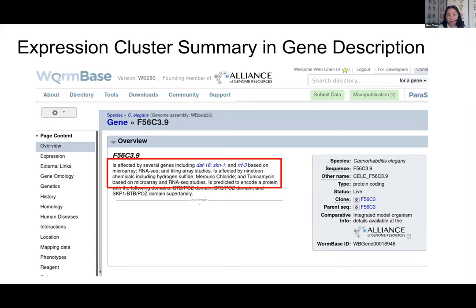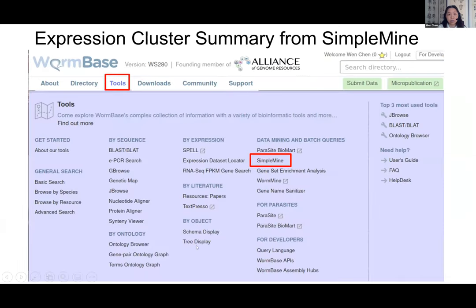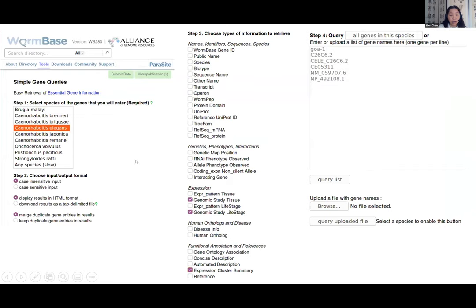Even though NSON5 was rarely studied and no one knew its phenotype or expression pattern, you already know a lot from the expression clusters. For NSON5, there are 66 expression clusters in WS280. There's a short summary on the overview page for each gene, but the overview has a word limit, so you usually don't see the complete summary. To see the full expression cluster summary, use the Simple Mine tool under the Tools menu.